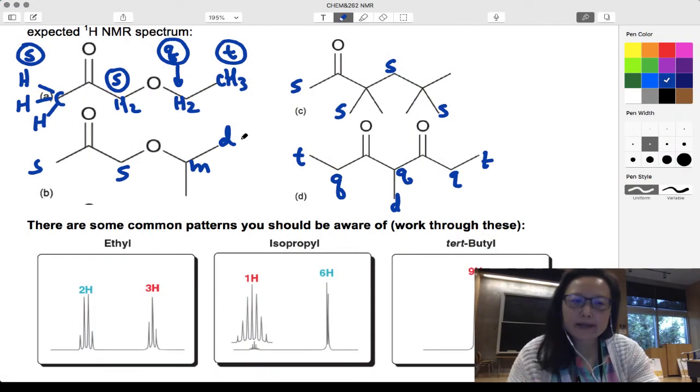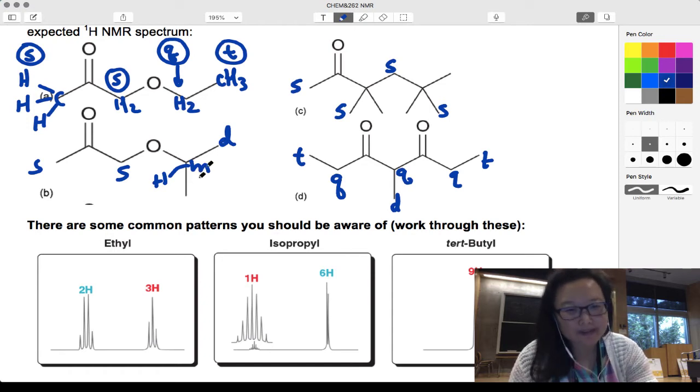Okay guys, so for this one, this is far away from here, just like we saw up here. These two are singlets. This is a multiplet. Don't forget there's a hydrogen right here. That hydrogen sees 6 equivalent hydrogens. These 2 methyl groups' hydrogens are the same, equivalent. So 6 plus 1 is 7, so you'd see a multiplet. And then these 2 methyl groups are equivalent to each other, so we'd see a doublet for those.